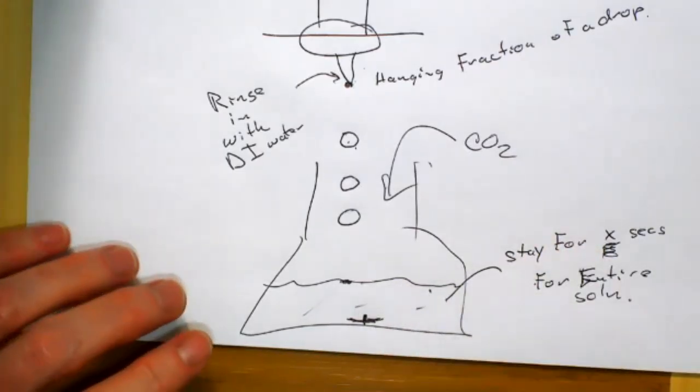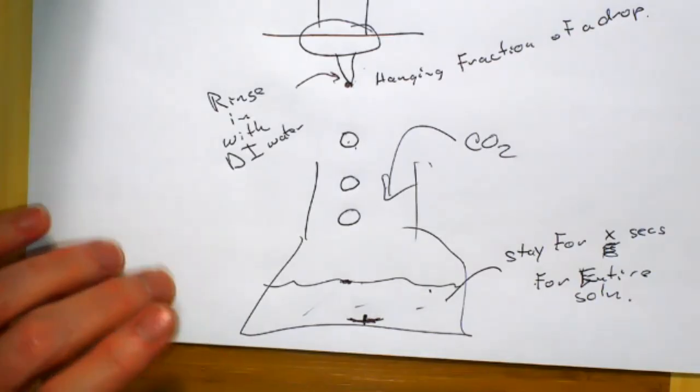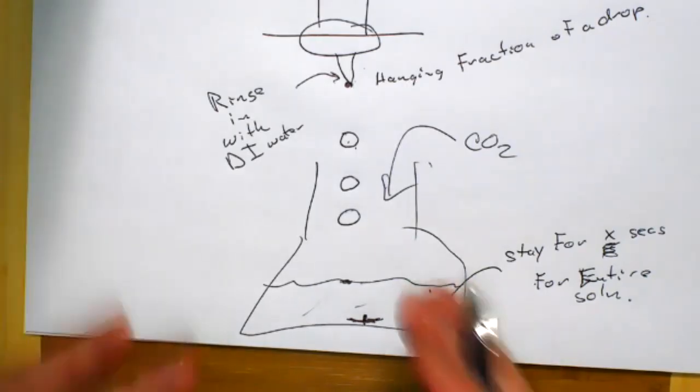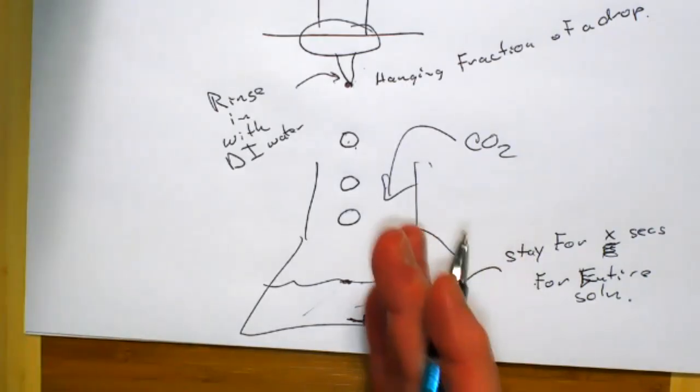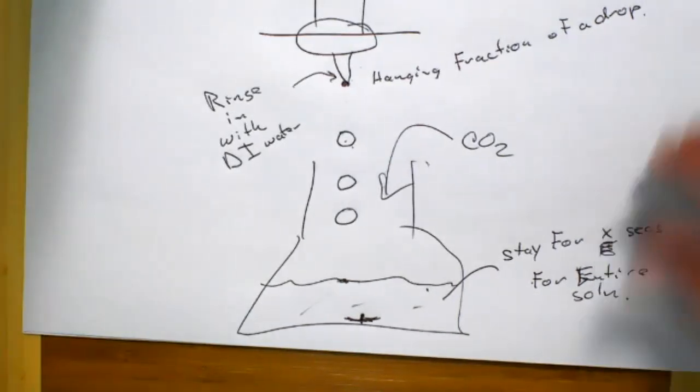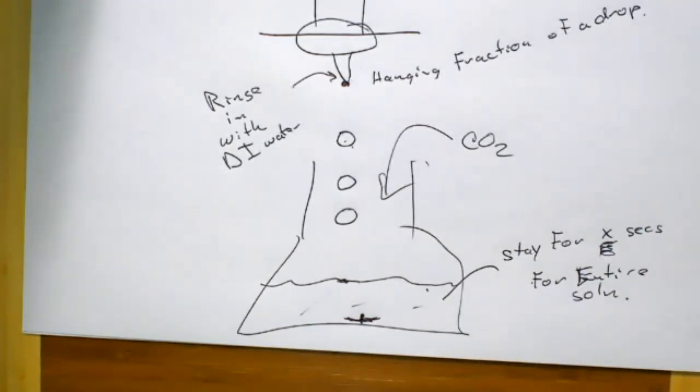I'm like, are you sure that's not reflecting off of the pink flowers down the street? It's so faint pink, and that's fine. That's great too. That means your titration error and your endpoint are very similar, but can you reproduce that? So there's a personal preference there.